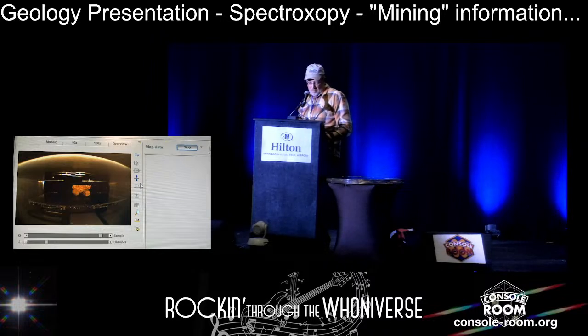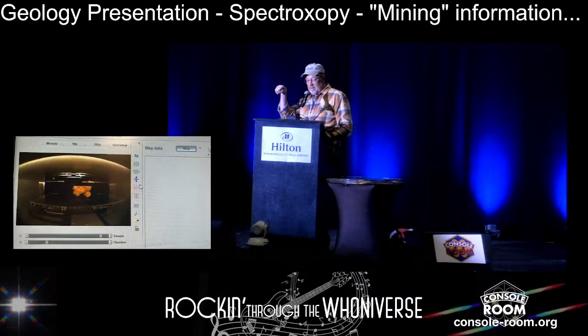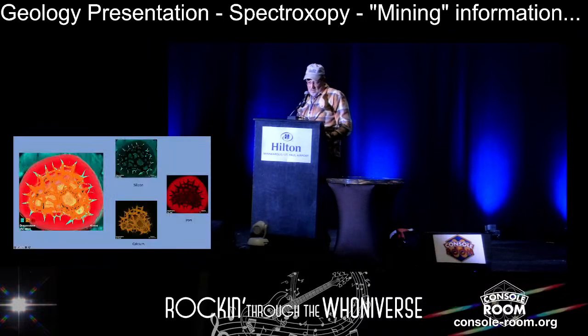The rate on this particular scan was set to, that's jumping back, but then it moves at 600 microns a second. So it actually takes some time. So we can display multiple elements from the scanner, we can display individual elements. And some of them are pretty spectacular.